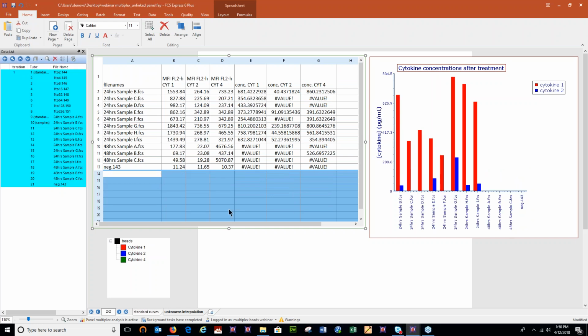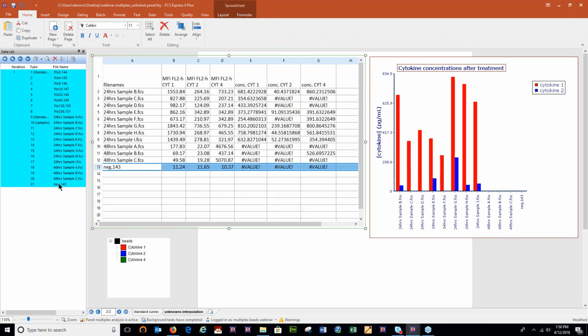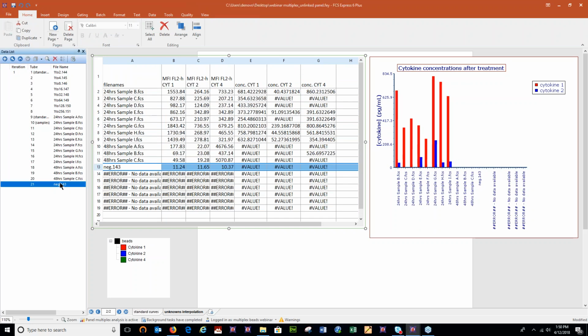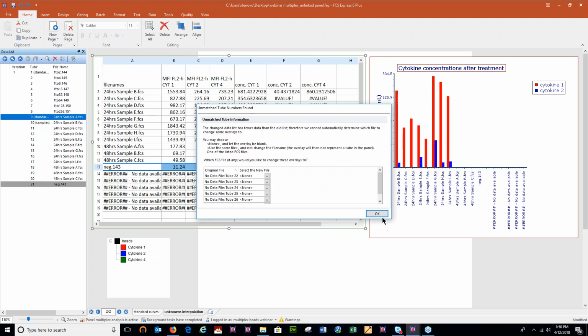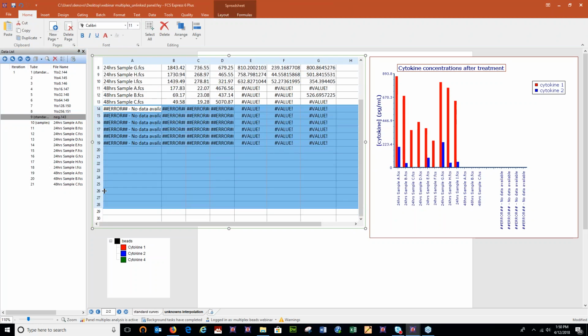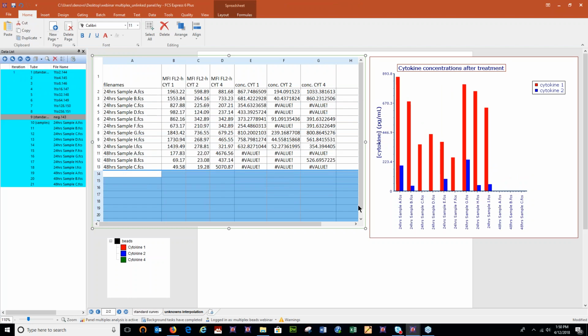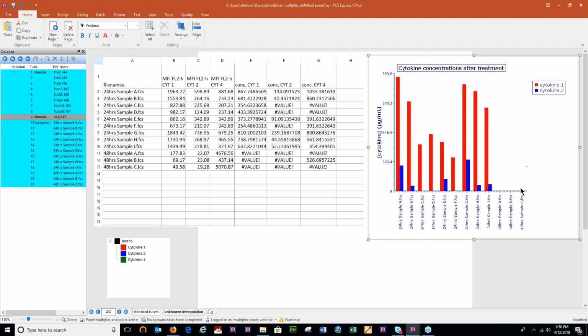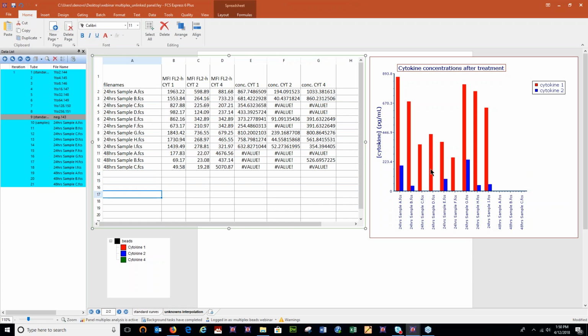And you see, I want to delete the negative, whoops. Forgot to reorder the negative tube up here. So let's just bring that up here into my low standard. All right, there we go. So now when we delete all of these, okay, you see now everything looks nice on your bar plot. I still have a few empty looking tubes, just because those particular samples are below the limit of detection, okay? But it does get rid of the empty rows for you.